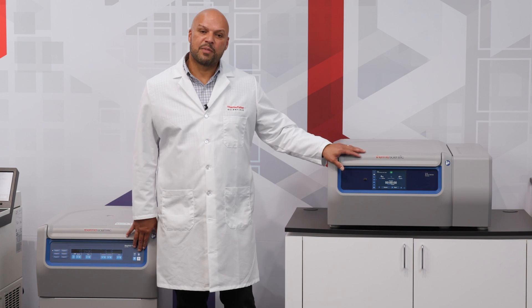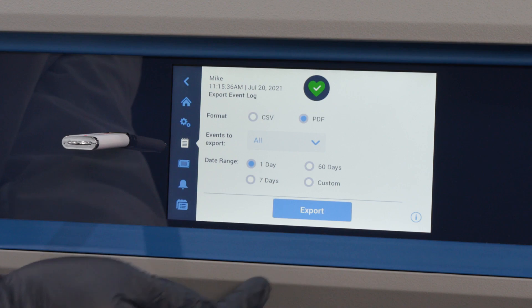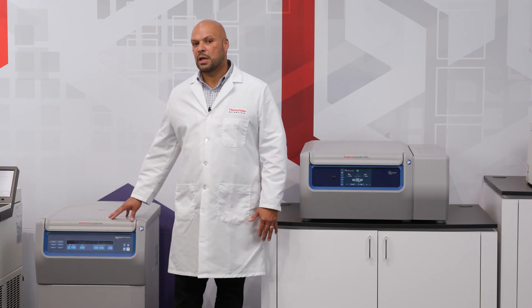Data extraction from either unit is pretty simple. With the X4 you will use the USB port, and with the ST4 it will be an RS-232.